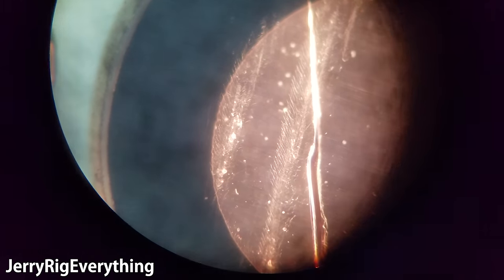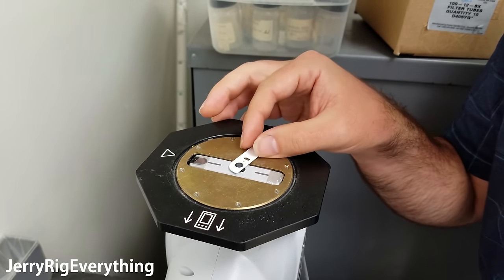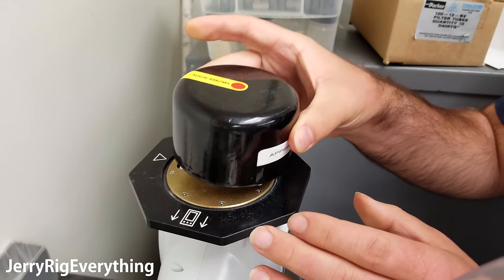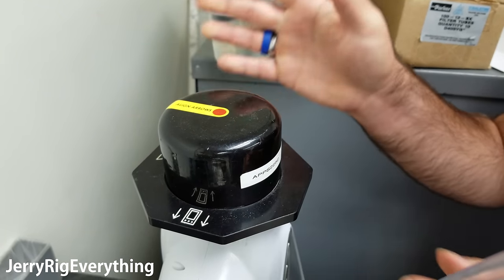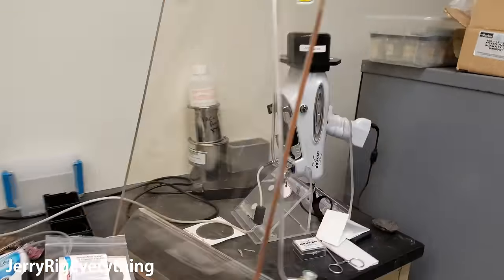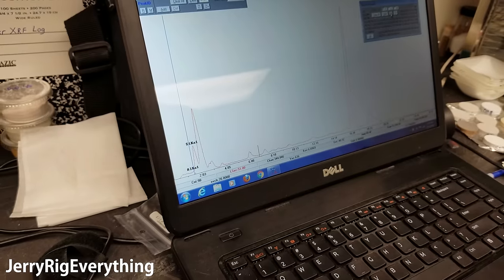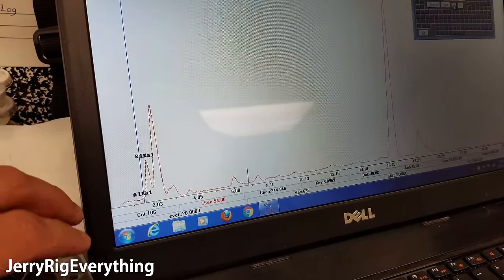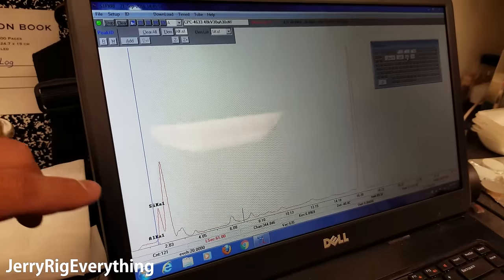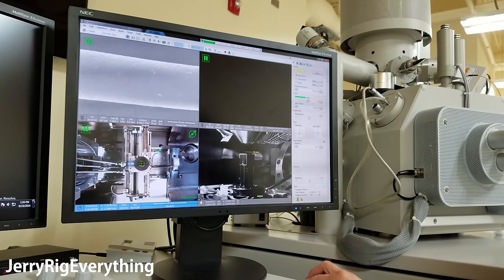I realized that in order to really analyze the lens, I needed some bigger toys. I headed over to a university where they have an XRF machine. X-ray fluorescence is a non-destructive analytical technique used to determine the composition of materials. Remember that this particular machine is only qualitative, not quantitative — so it won't tell us the percentage of each element, just if the element exists in the specimen. When I tested the outside of the lens, I get a huge reading of aluminum oxide, which means the lens is most definitely sapphire on the exterior. When I tested the inside of the lens, I get no reading for aluminum oxide, but I do get a reading for silicon, which is an ingredient of glass. This means the underside of the lens is made of, or coated with, glass — though the XRF machine does not tell how thick each side is.